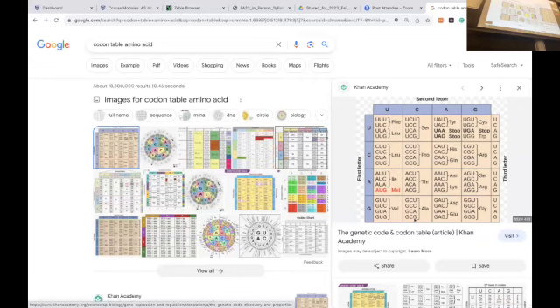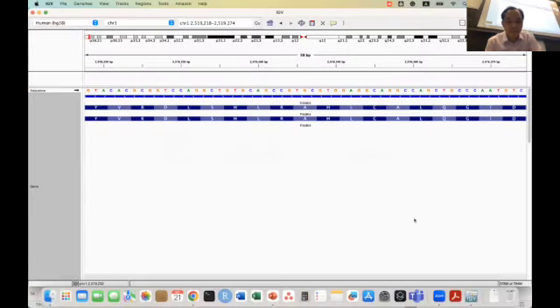Right? Now it's time to check the DNA sequence from the IGV browser. And for this particular IGV browser, it's a TGC. You know, I'm doing this on purpose.